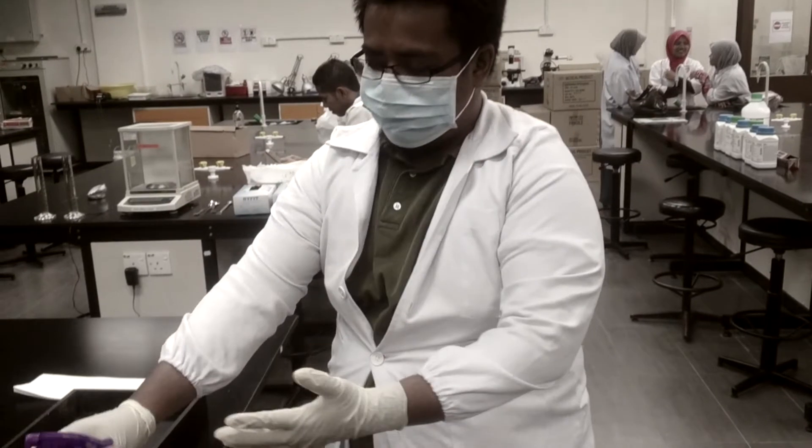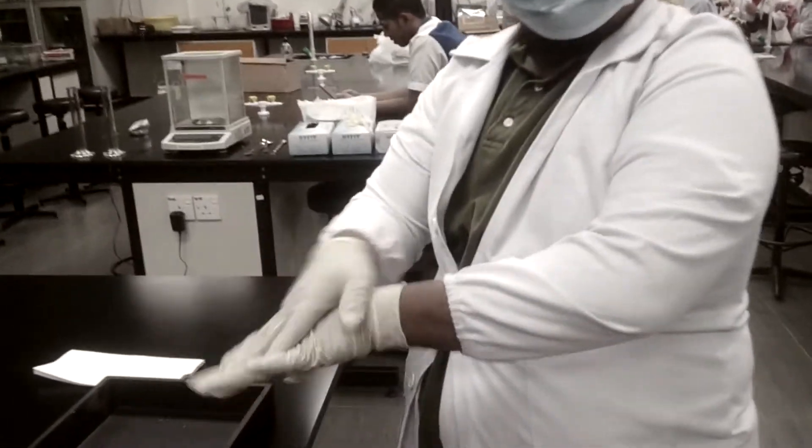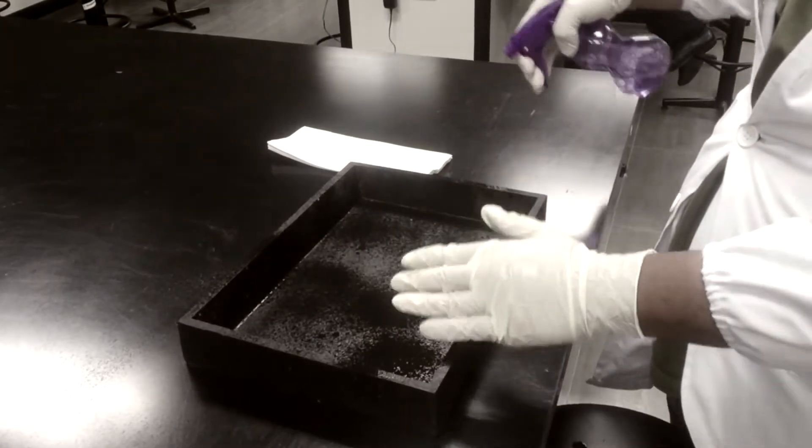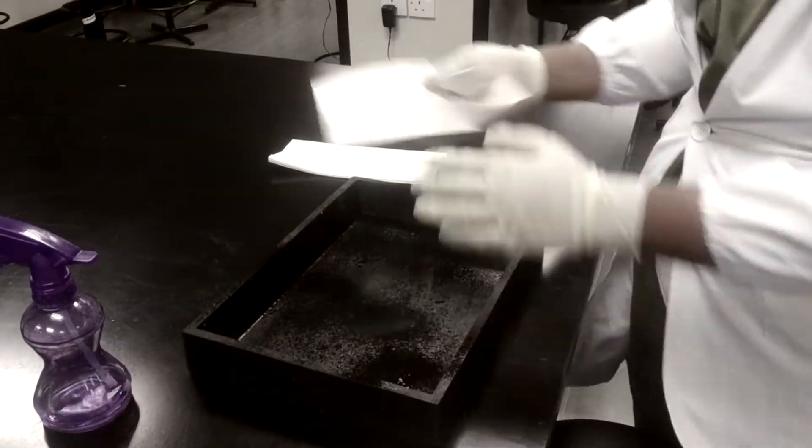Before we handle the fish sample, we must disinfect everything. This is done by 70% alcohol solution.